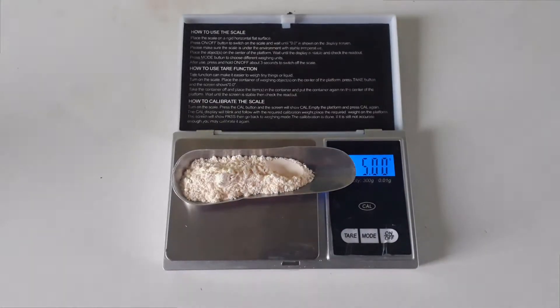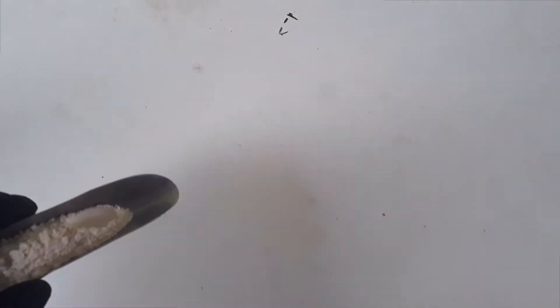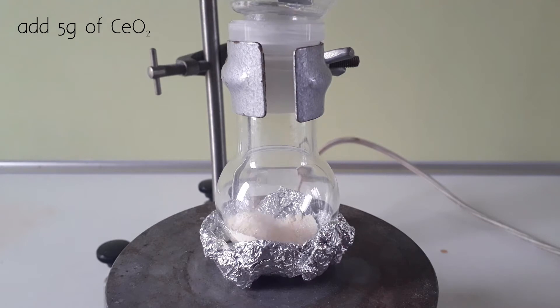To start off with the synthesis, I weigh out 5 grams of cerium dioxide and add all of it to a small round bottom flask, followed by a stir bar.